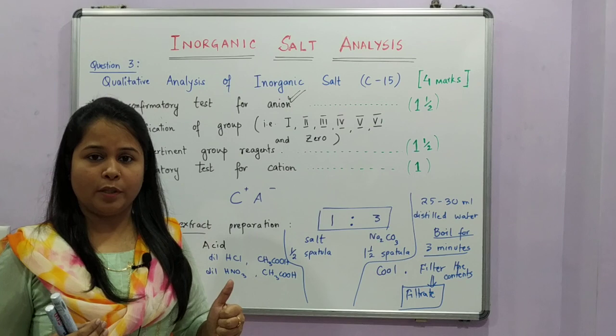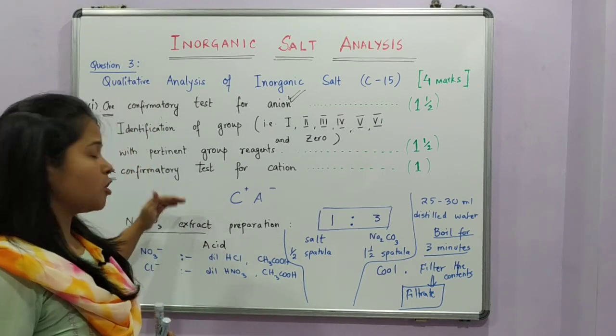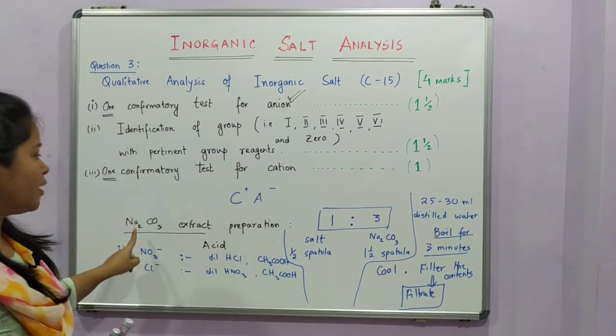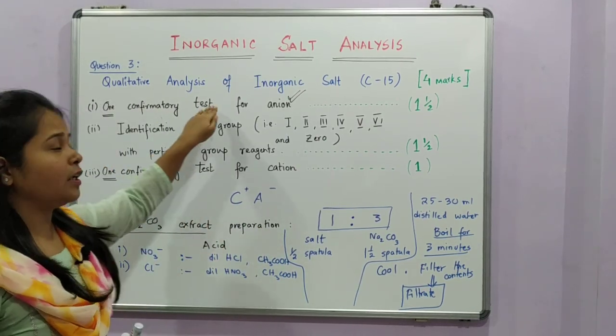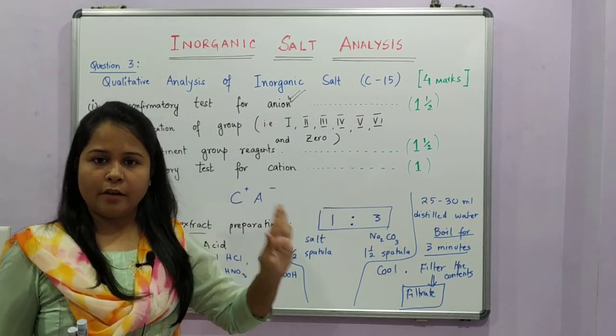Be very sure with it. Whatever the confirmatory test you do with the sodium carbonate extract, be very sure it is only for the confirmatory test for the anion. For the cation, we need not do this, right?